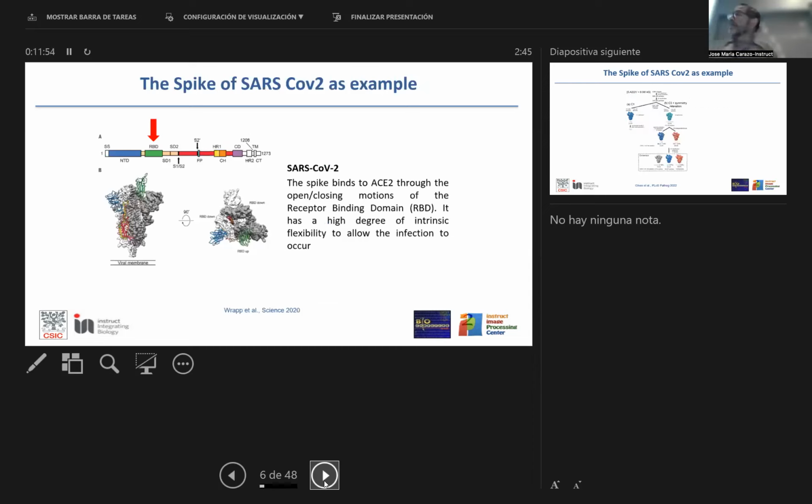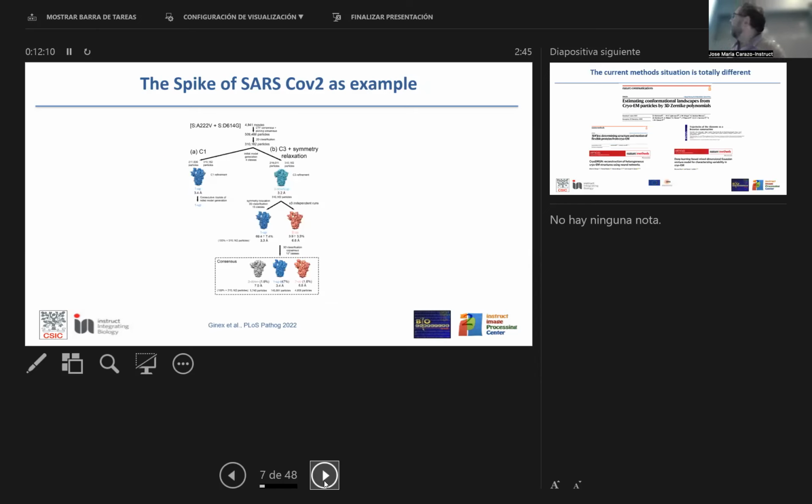In fact, I am going to use this data set for several things in the talk. It is a data set produced by José-Maria at the beginning of the pandemic that we have used for many things. I am going to present just what happens when you start analyzing that data set and other data sets with the programs that we developed, with Relion, with CryoSPARC, based on ML.